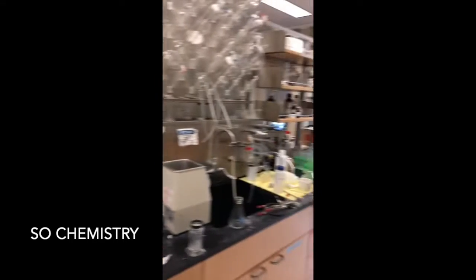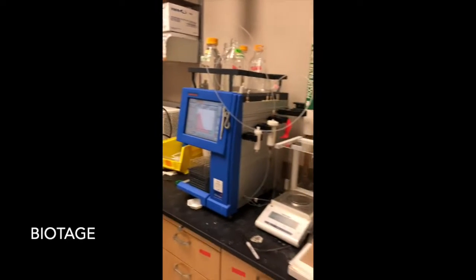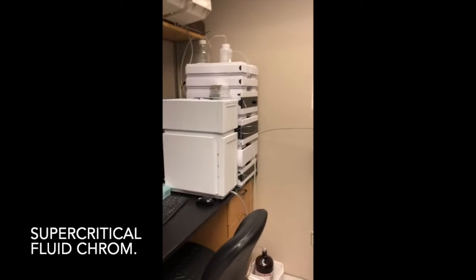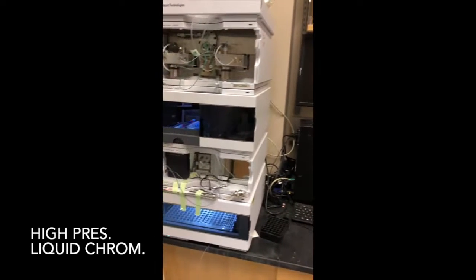As we move out of that bay, or spin around a bit I guess, but then move out of that bay, we enter a side room here where we have our biotage. You also see a balance in another rotovap. But we also here have our SFC, our UPLC, and our HPLC.